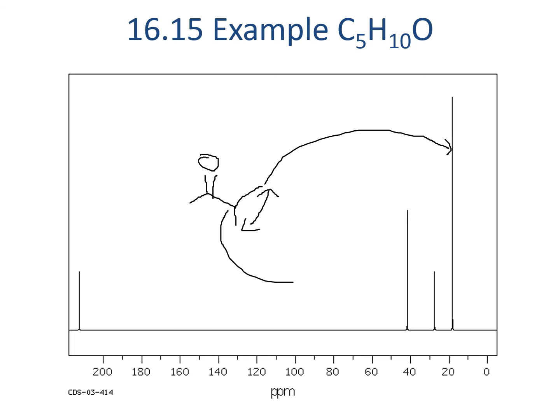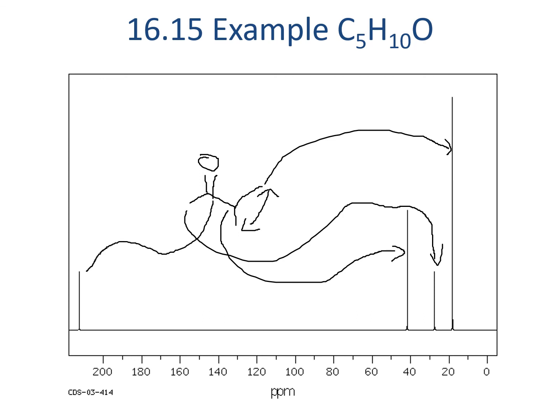This one is going to be here. It's got the more electronegative carbons than the hydrogens, and it's closer to the carbonyl, whereas this one should be over here. And then way on the other side, we see this highly shifted carbon representing the carbon of the carbonyl. Because it's double bound to oxygen, that oxygen will significantly de-shield that carbon.